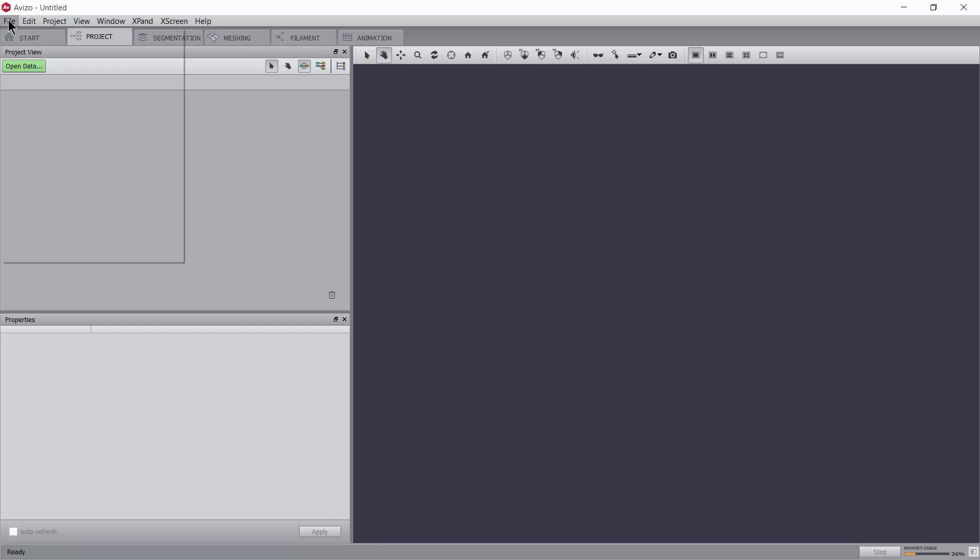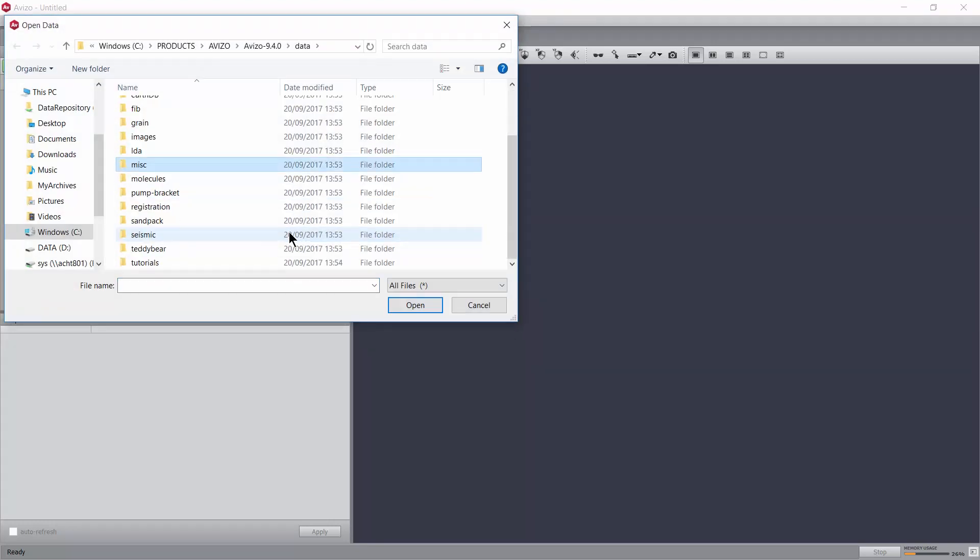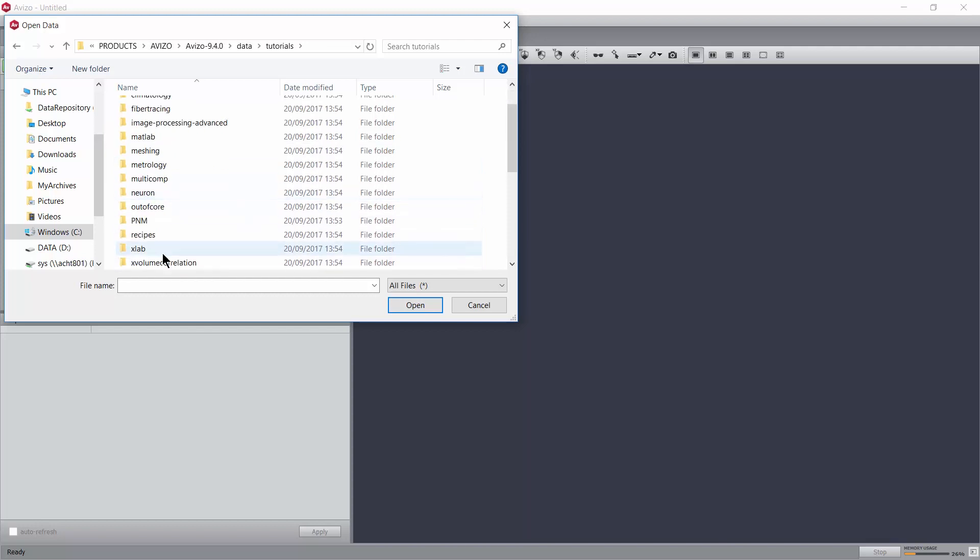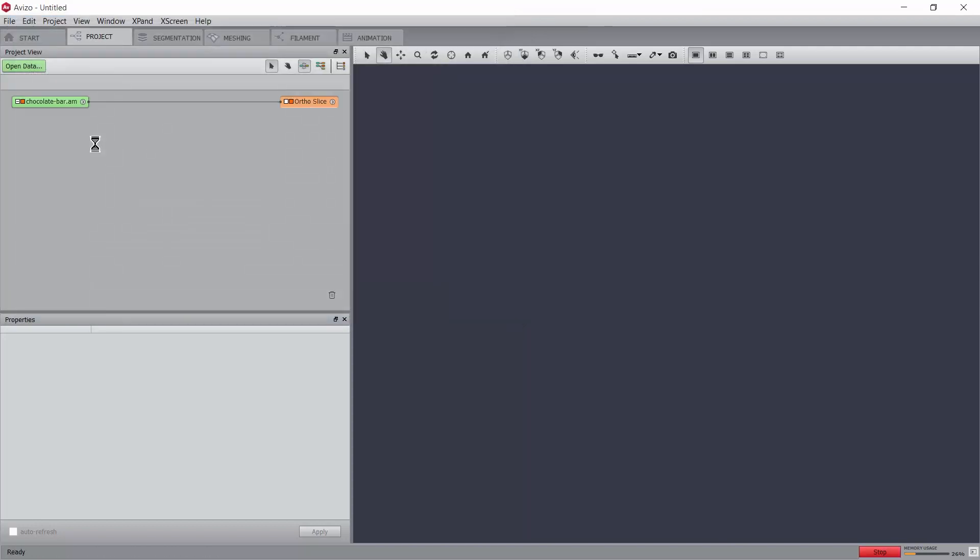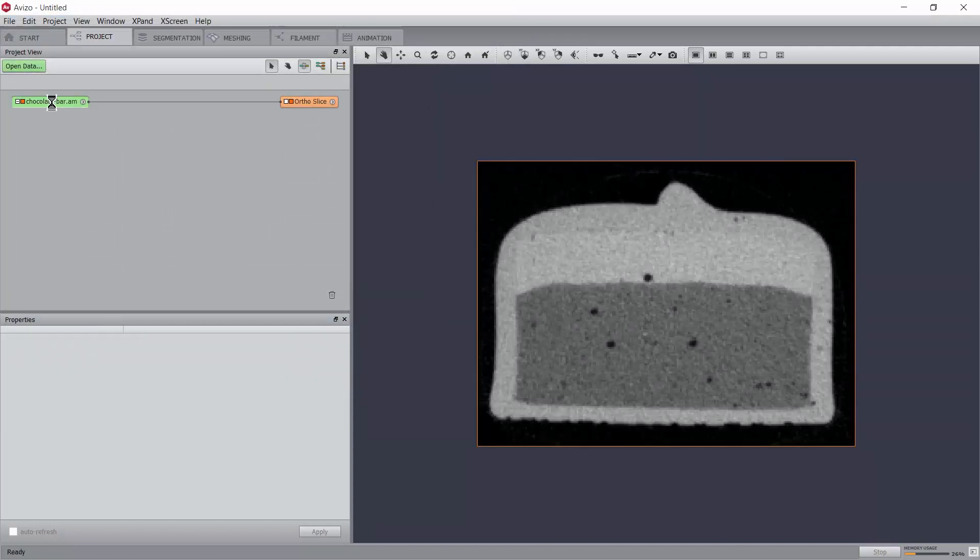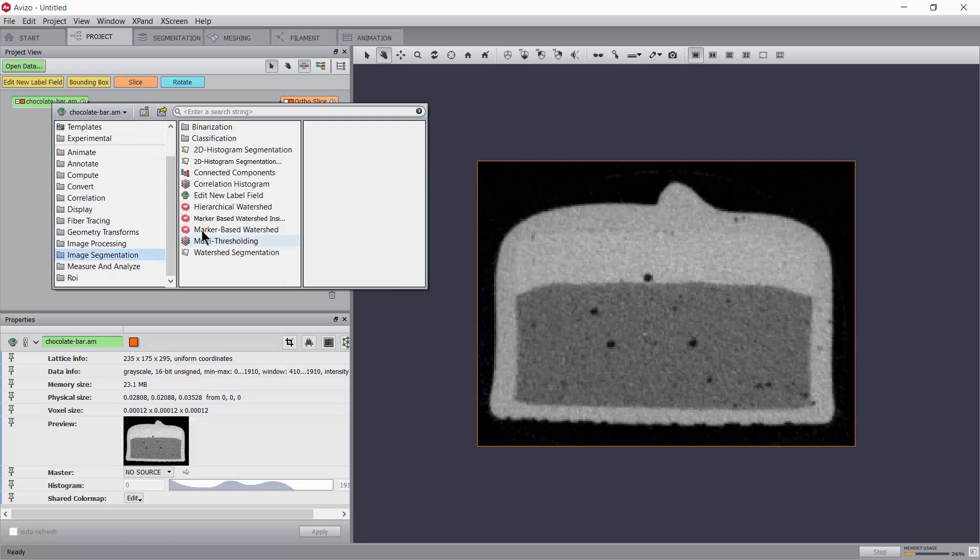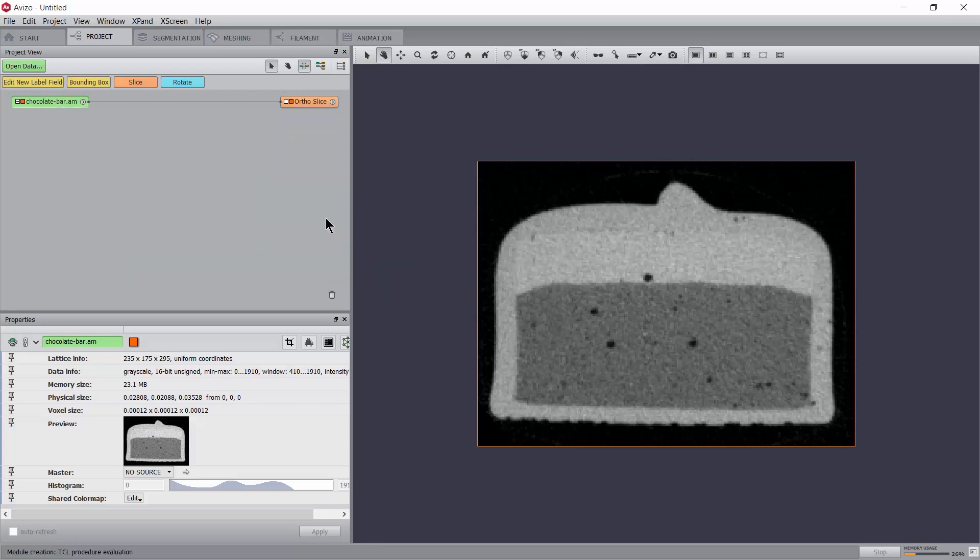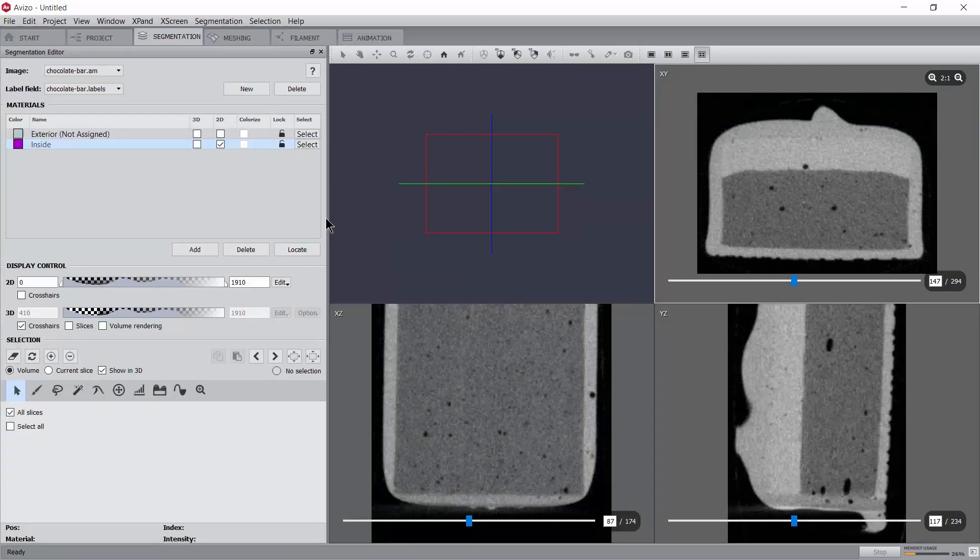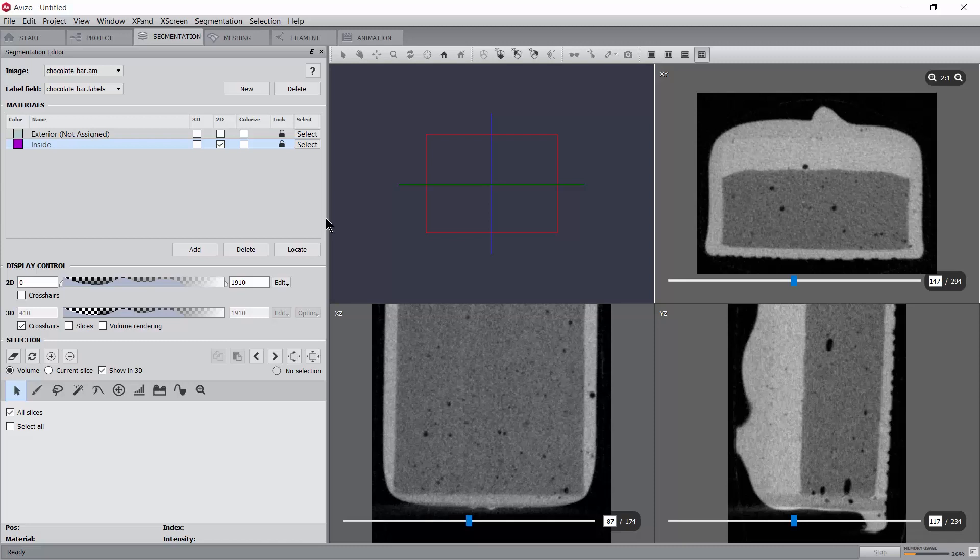We'll work on the file chocolate bar which can be loaded from the folder data tutorials. Right click on the green icon and select edit new label field from the image segmentation section. This will automatically launch the segmentation workroom, thereby replacing the user interface. At the same time and not currently visible, a new data object will be added to the project view which holds the segmentation results.